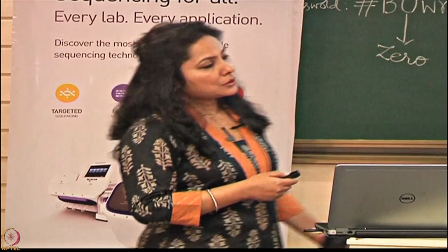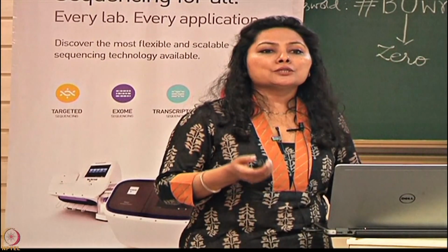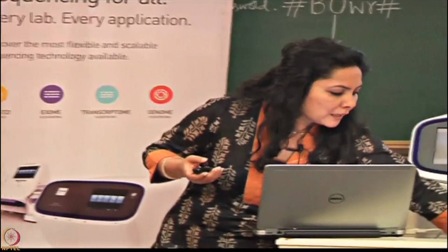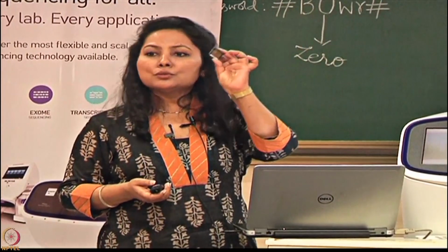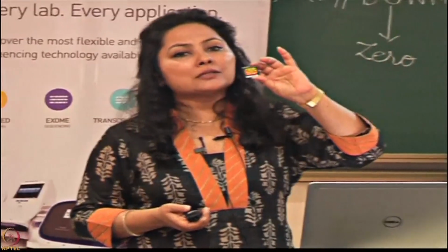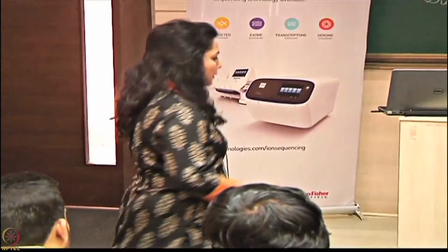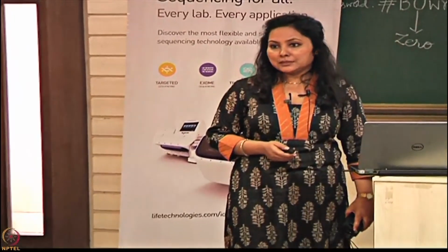Coming to next generation sequencing. As I mentioned, this is a technology wherein you have millions of wells. These are the chips which are used with Ion technology, and you have millions of wells on these chips. You can imagine that each well has a sequence, and that is how you are generating millions of sequences in a run.